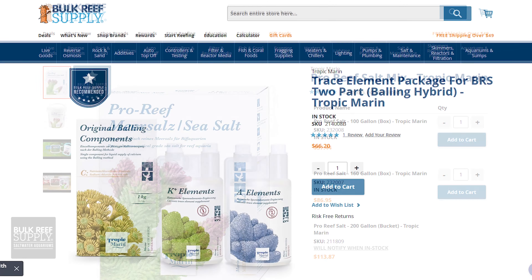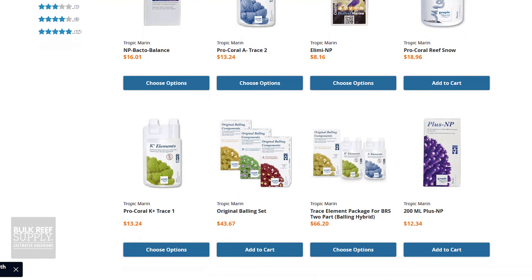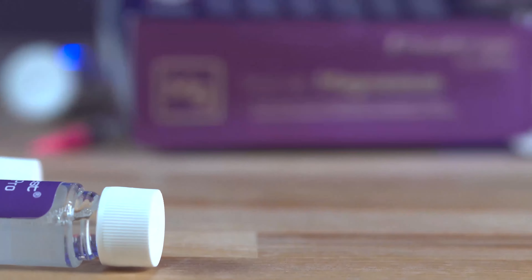Tropic Marin has really set the standard for quality in the reef aquarium hobby ever since the 1960s. From salt to trace elements and beyond, Tropic Marin knows a thing or two about keeping aquarium parameters steady. And if you've been in the hobby for a little bit longer, you get to clear out all of those individual test kits you've purchased over the years and just stick with this one right here.